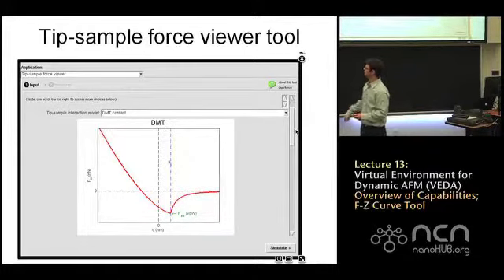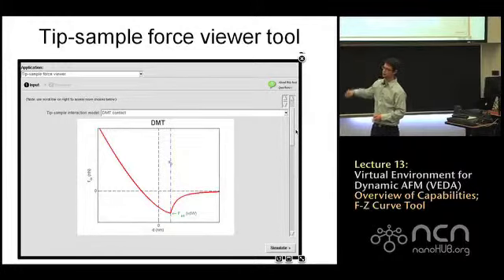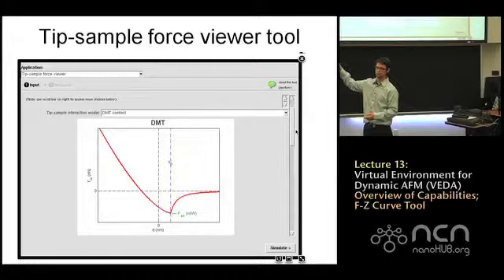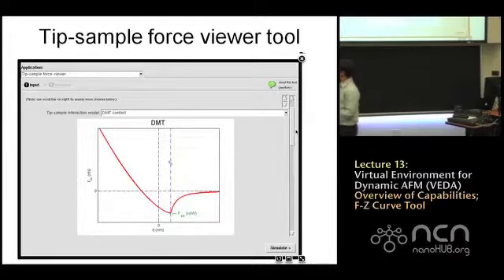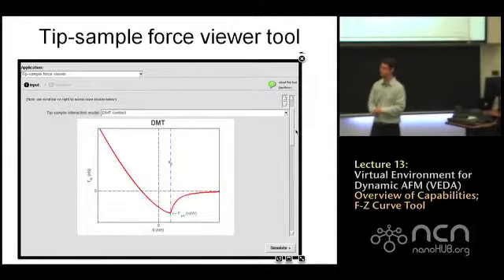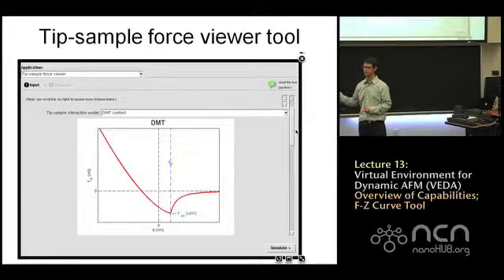And then at some separation, A0, which we call the intermolecular gap, is the onset of repulsive forces. And we assume this is continuous, but it works out to be non-smooth. And then after we start indenting the sample, the repulsive forces are modeled by Hertz contact mechanics. So for any gap less than A0, we're said to be in contact with the sample.